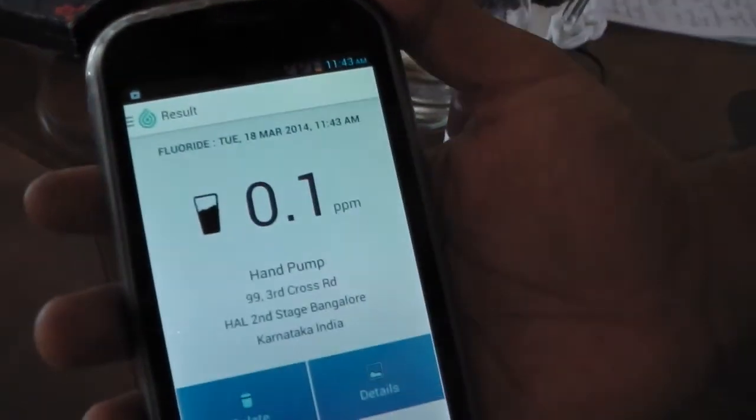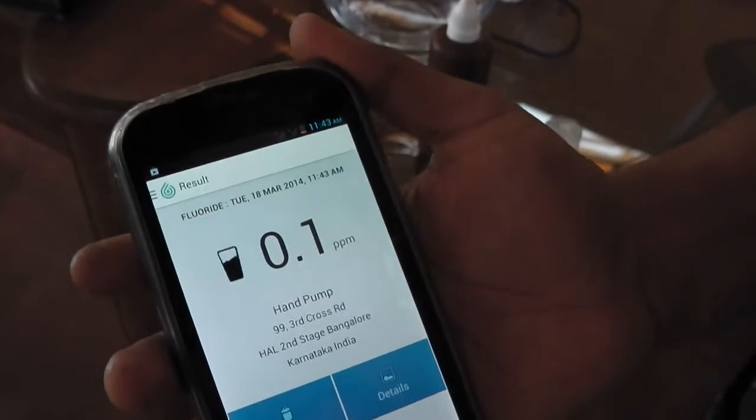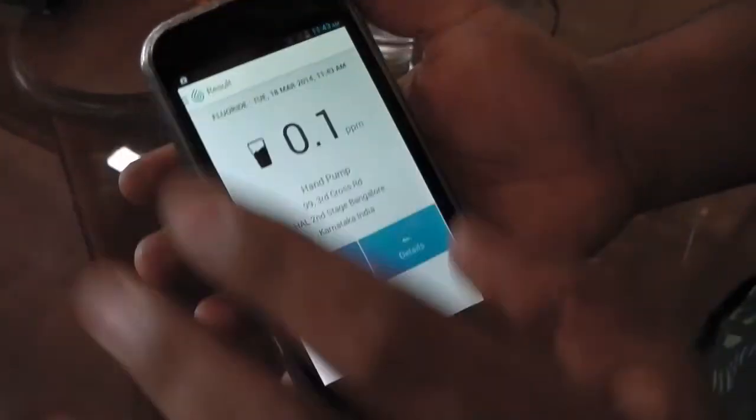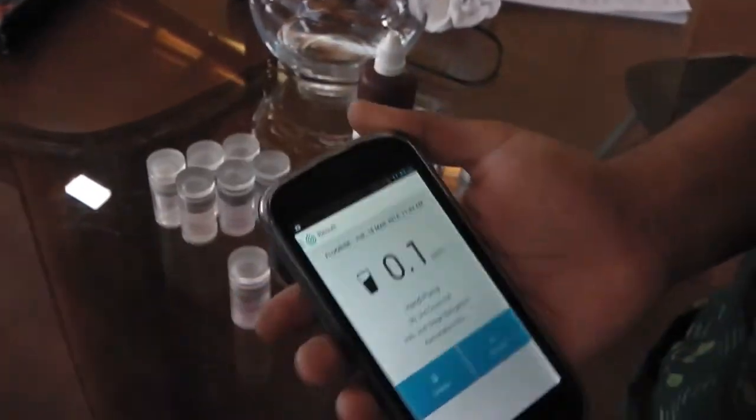That's the result — it's showing 0.1 ppm. This was a sample I had made previously; it was zero ppm. So there's a small discrepancy. And it based that reading entirely on the color change.